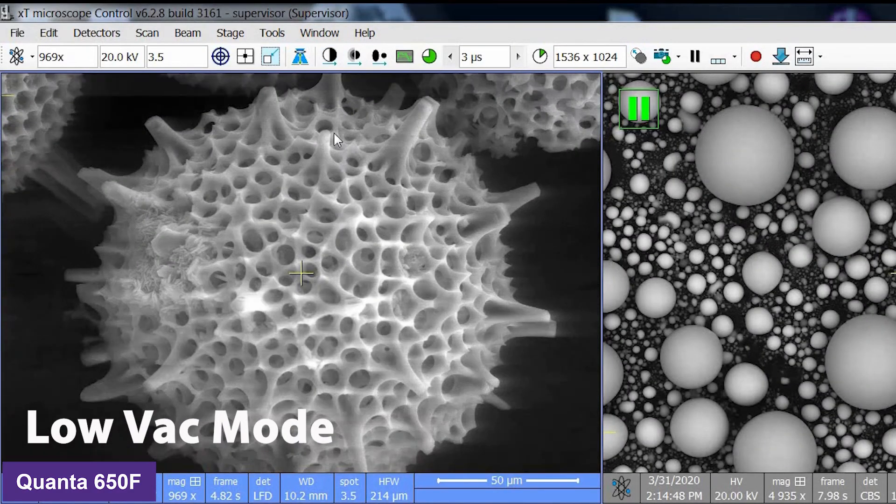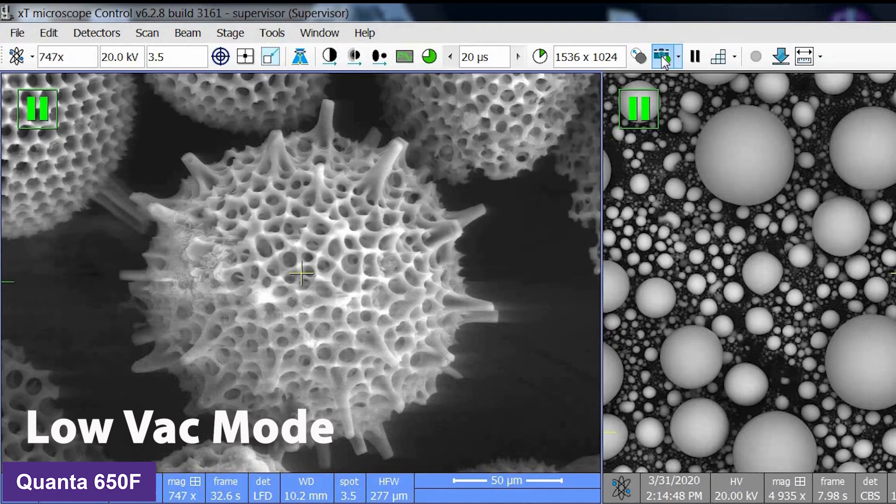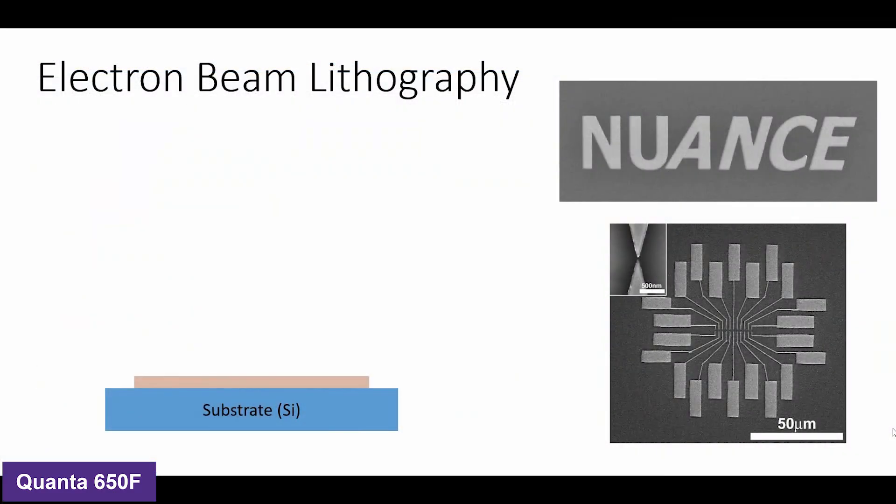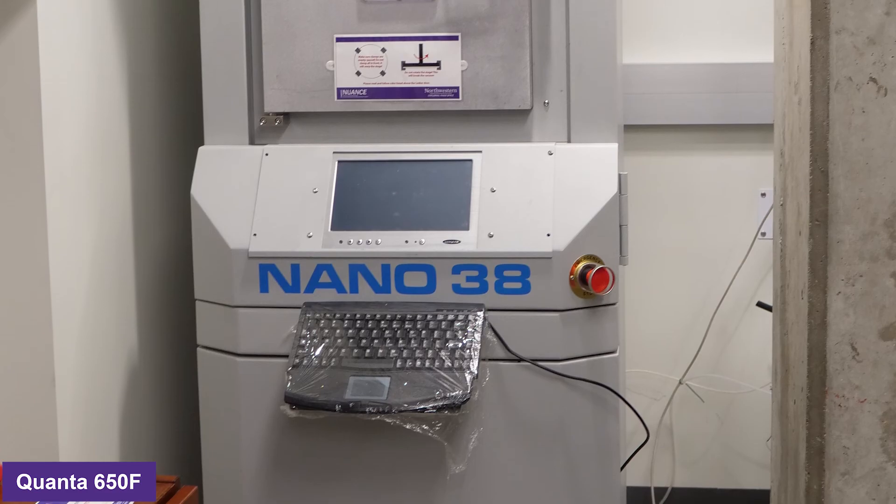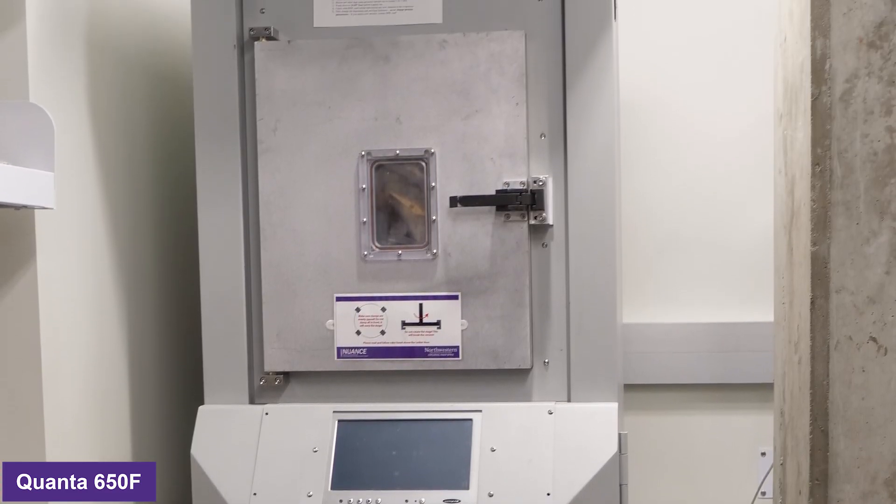This SEM also has low vacuum mode for imaging non-conductive samples and an electron beam lithography system. EBL is a technique used to create microelectrical devices by scanning the focused electron beam in a pattern to create custom shapes in a substrate coated with an electron-sensitive film. The EPIC lab also has a metal evaporator that can be used as part of this process.